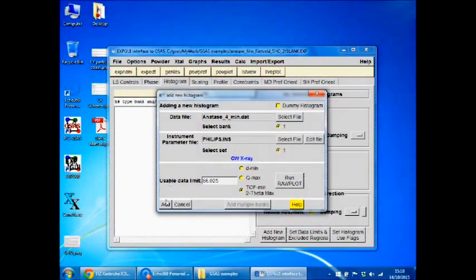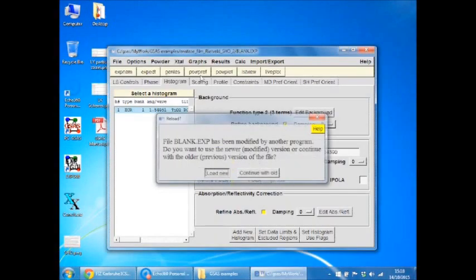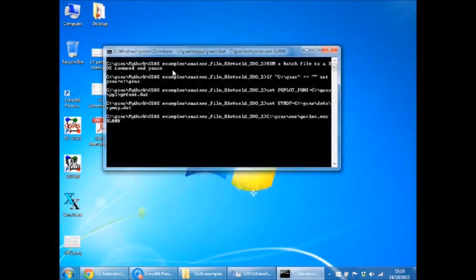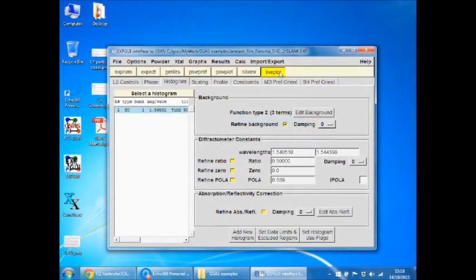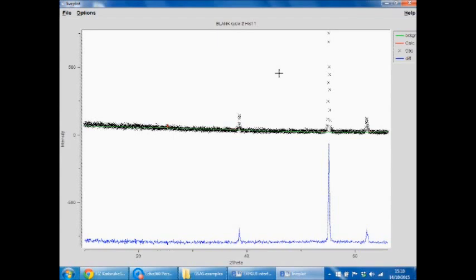But there's a very big difference in the preferred orientation. And you'll see that very soon. See? Huge preferred orientation in this film. There's absolutely no growth in the 101 plane under these conditions for some strange reason. I don't know why, but that is the case.